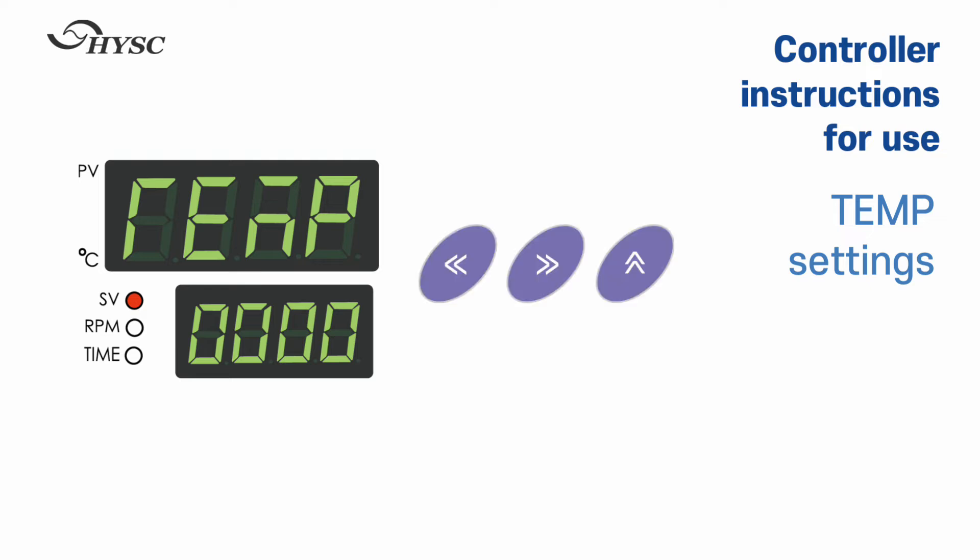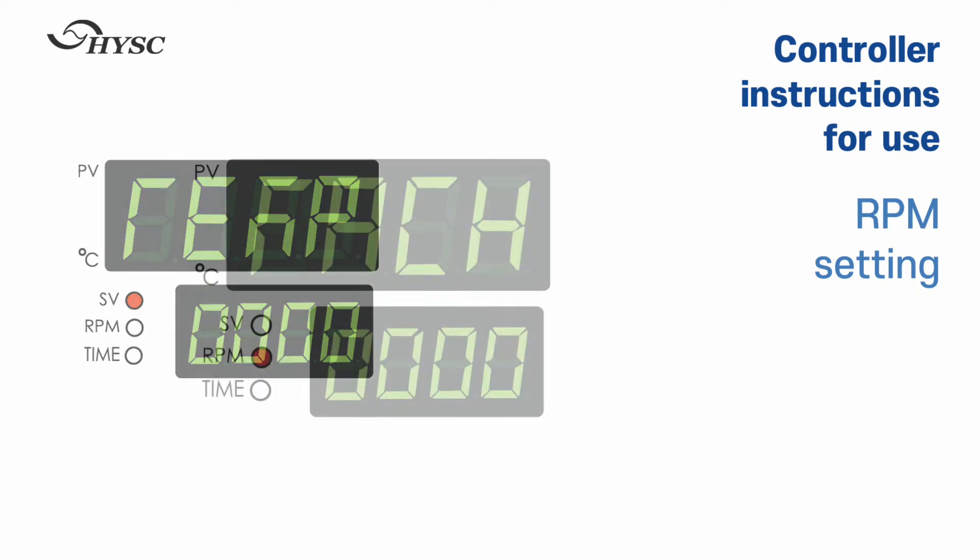Set the temperature using the digit shift keys. The temperature range to be set is between 20 degrees Celsius to 100 degrees Celsius.